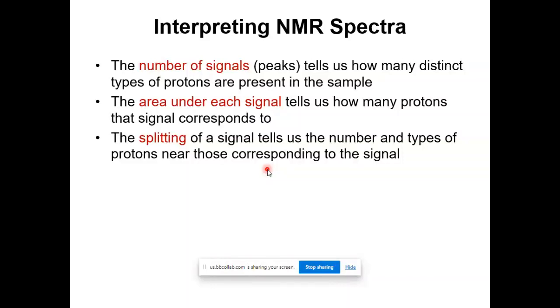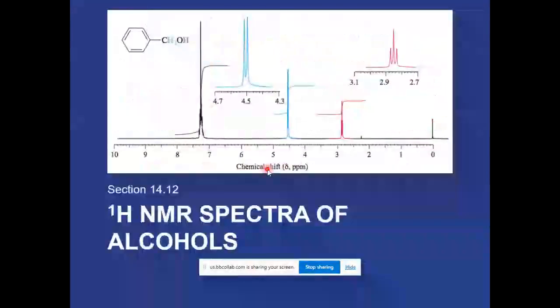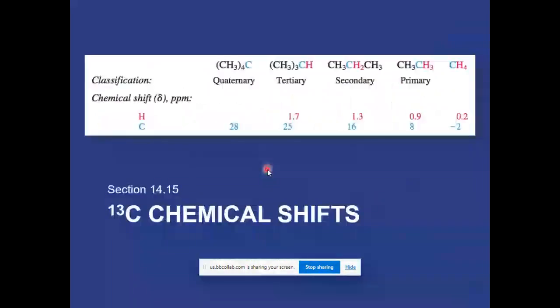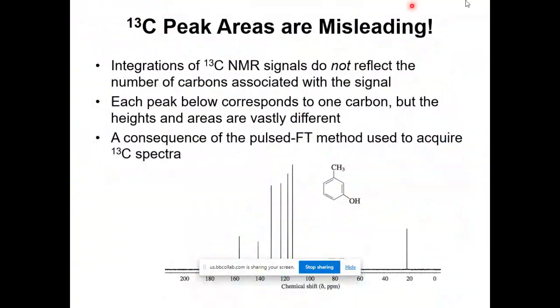Okay. So what kind of information can we extract from carbon 13 NMR? Can we extract more information from a carbon 13 NMR spectrum in terms of the intensity of individual peaks? Unfortunately, in this case, the peak area doesn't really tell us anything about the number of carbons.